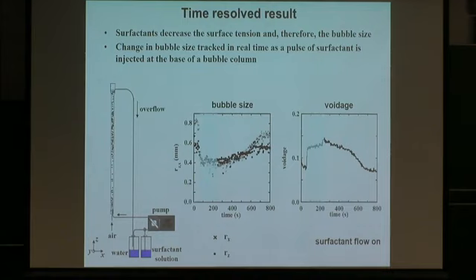If you're looking at a very specific thing that you want to measure, it may be the size of something inside something, or whether you've got something that's turbulent or laminar flow within something which is optically opaque. So potentially, if you know what it is, it would only be for a specific application, but you can think about producing a much simpler system, acquiring just a few data points on a relatively cheap machine.